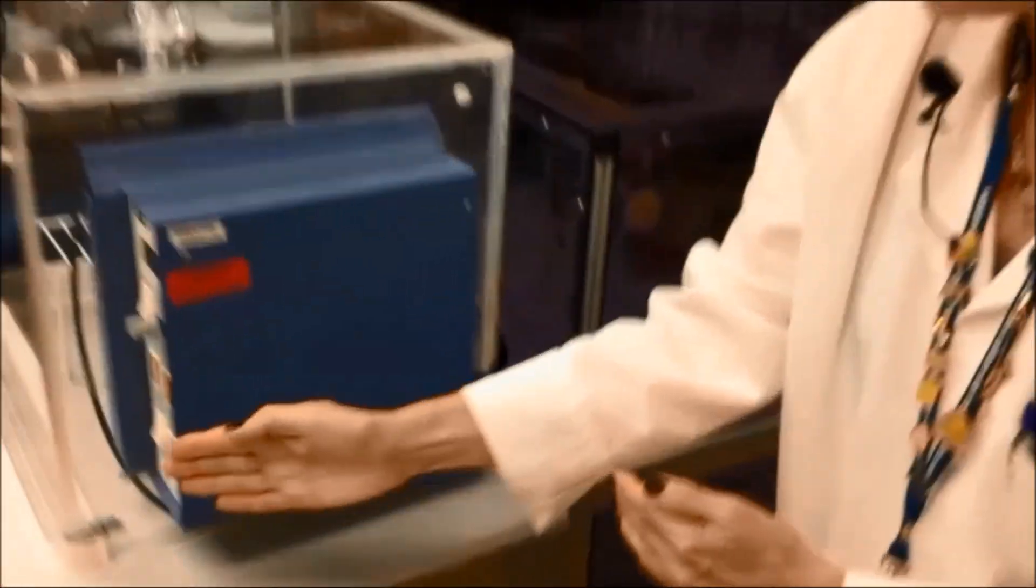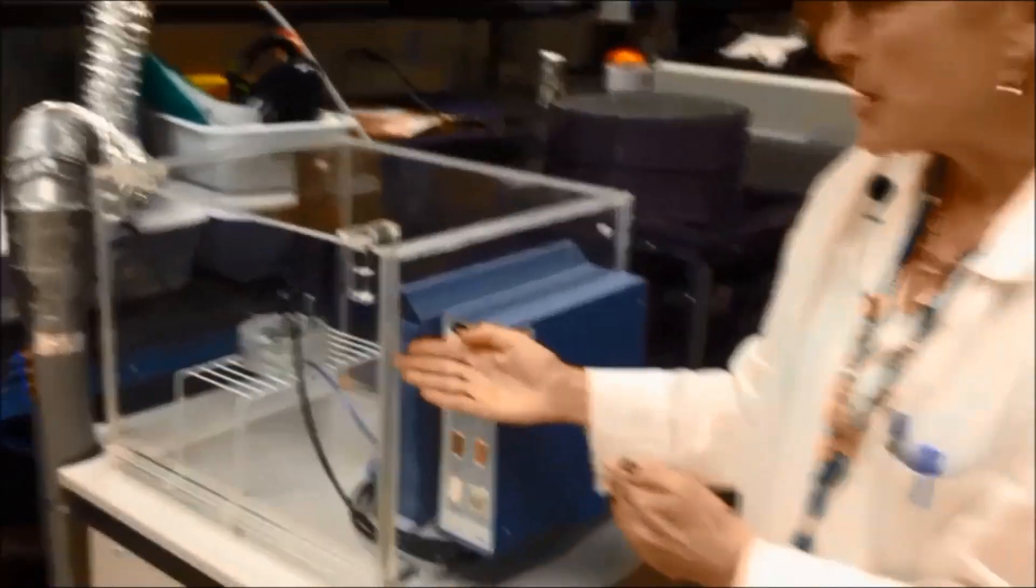The smoke dilution is going to go up through the black tubing, it's going to come around here into an incubator that's at 37 degrees.